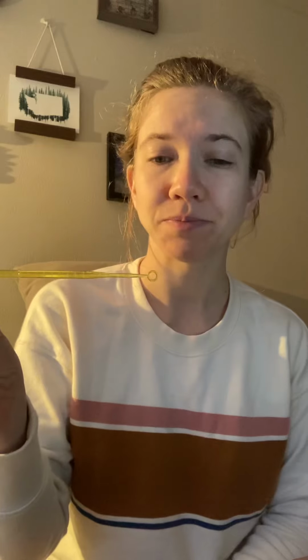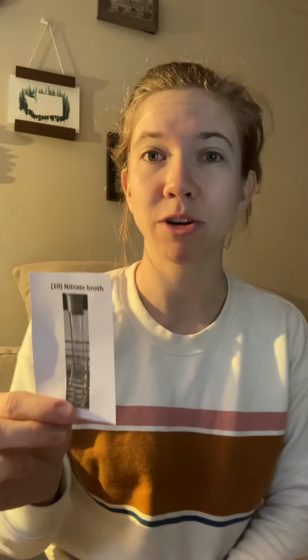I have everything up on my computer, but I also have it printed here just to make things easier. As far as aseptic technique goes, we want to have our hair up and tied, goggles, gloves, and apron if necessary. Make sure you wash your hands when you enter lab, wipe down your lab station, all that stuff. For this lab, we're going to be using an inoculating loop. In the real lab, we'd have 5 broth samples, but in this case, we're just going to show you one.